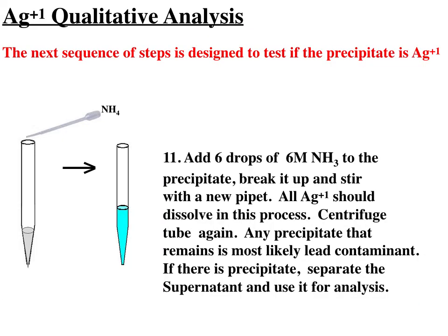What remains to be done is to verify the precipitate that was formed from the lead and silver separation. Remember, the lead was placed into the aqueous medium by complexation and separated from a solid precipitate below it. But now really all we need to do is to verify that that solid precipitate does contain silver.